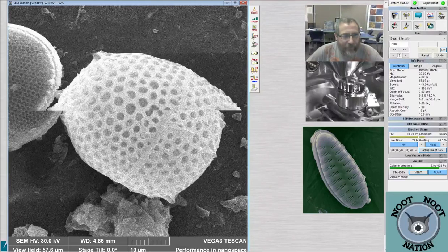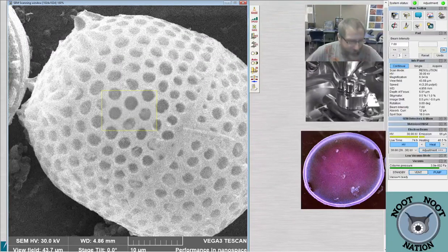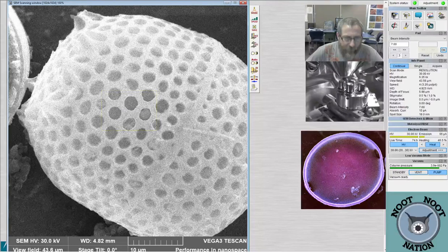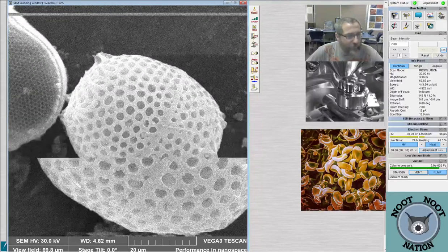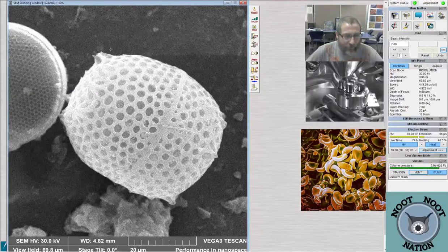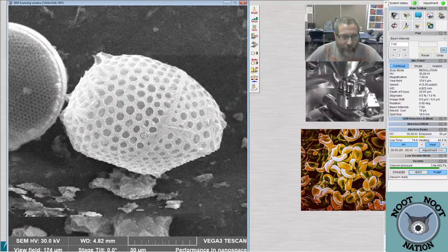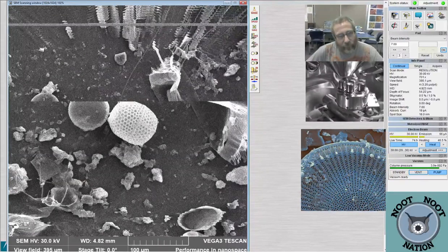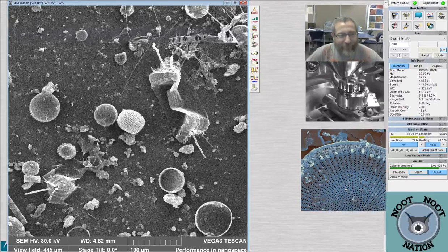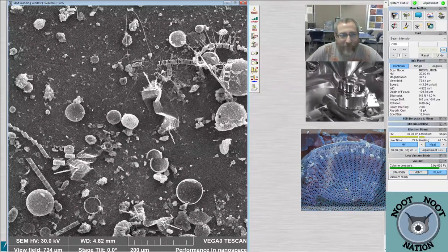Oh, look at that. Is this Stephanopyxis? It's a little capsule. I don't know, you were calling one of them Taurus, but this one I don't think is Taurus, or it's not the same as the other one that we saw, or it doesn't look like it to me. Yeah, so the Taurus one is the one that knuckles together. Yeah. And it's the other one. I don't know the names of them, so. Yeah, and I'm learning. Right.